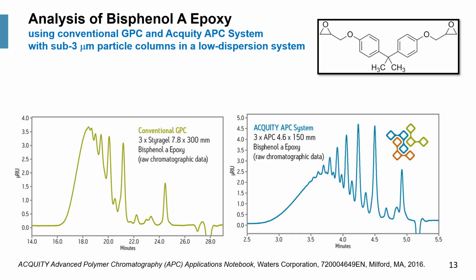In this case study, we compare the resolution of bisphenol A epoxy using a conventional GPC, using larger particle columns.